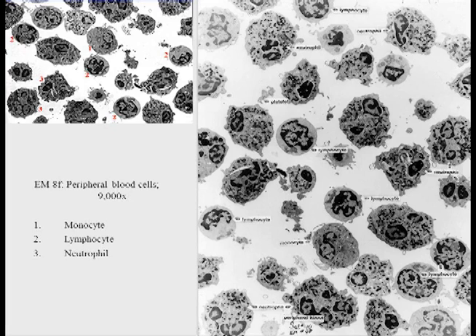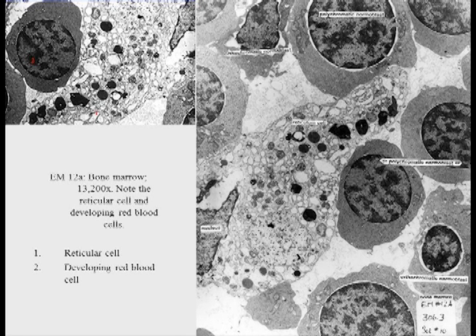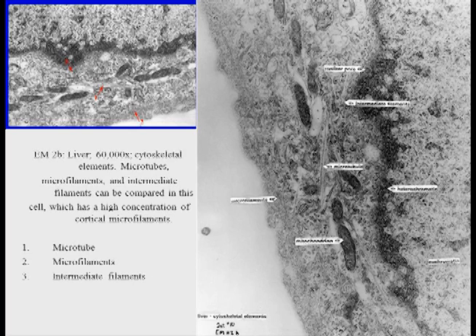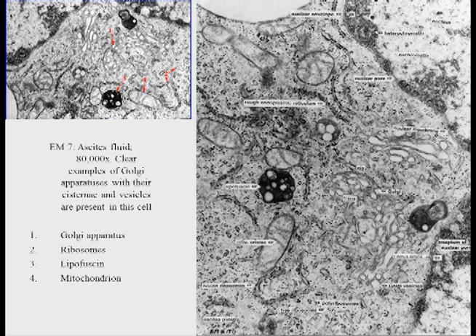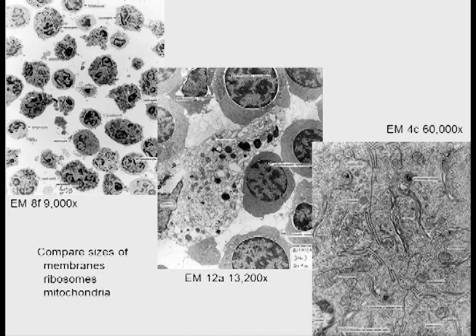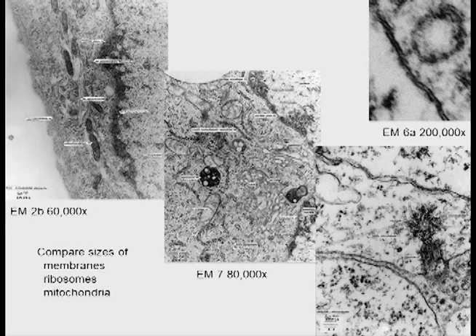Here we see a host of white blood cells, and you see ribosomes increasing in size in this group of cells. Then we see ribosomes a little larger, even larger. Here we see microtubules and the ribosomes are even larger there. If we want to look at ribosomes, look at rough endoplasmic reticulum — you can get a feel for what the size of the ribosome is. And then finally at higher magnification, you can see the lipid bilayer as well. We can see the magnification going from 9,000 to 13,000 to 60,000, all the way up to 200,000 magnification.